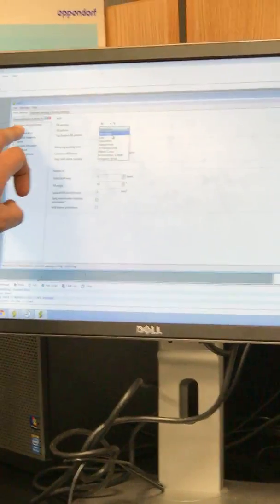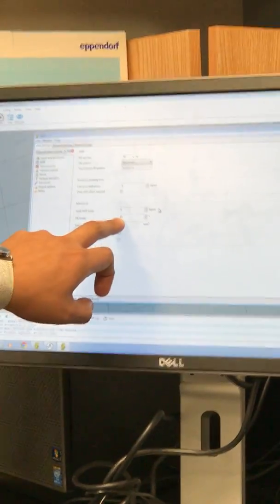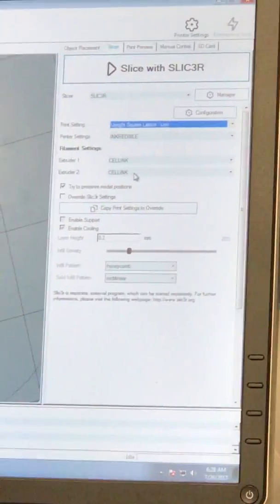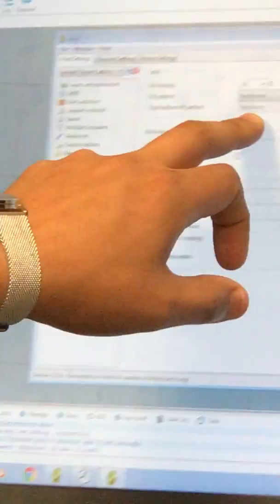For the diagonal square, we have the rectilinear with a 45 degree angle. If you select the upright square lattice, that one has a 90 or 0 degree angle. It has the same rectilinear but zero angle.